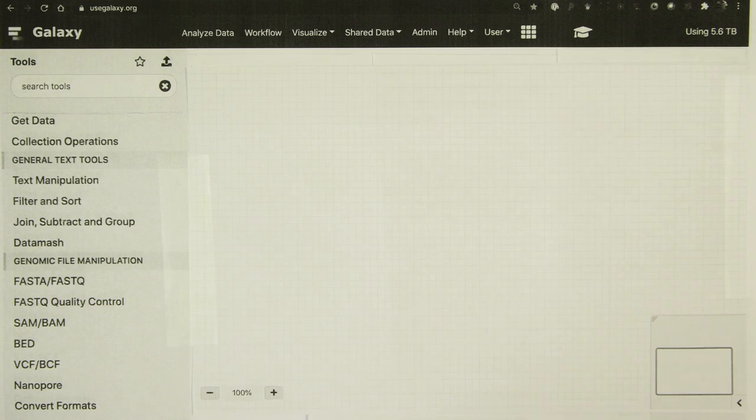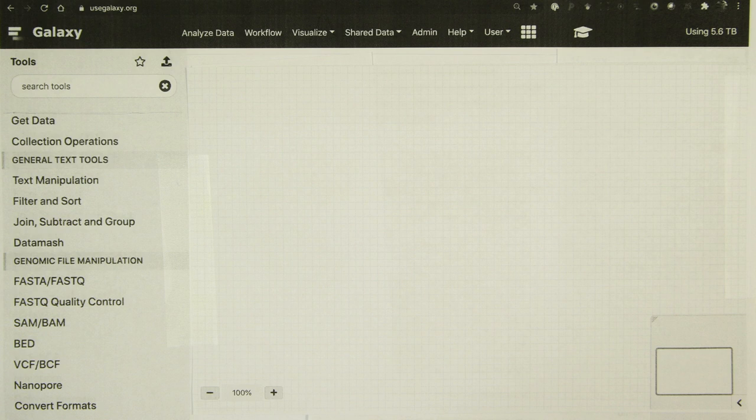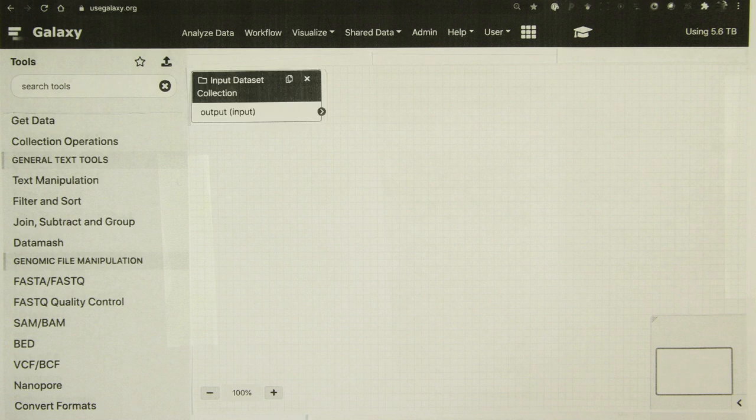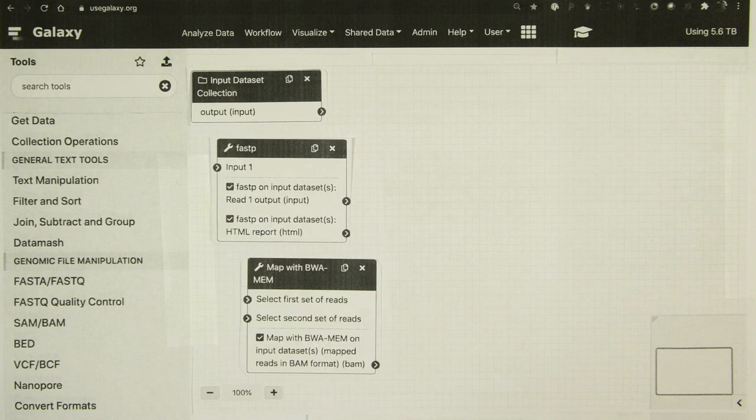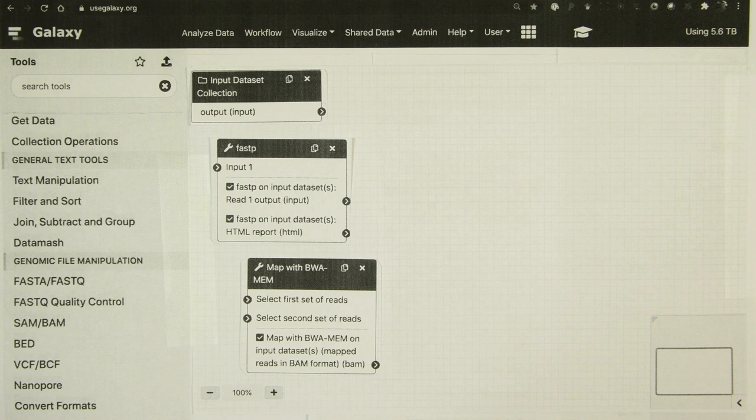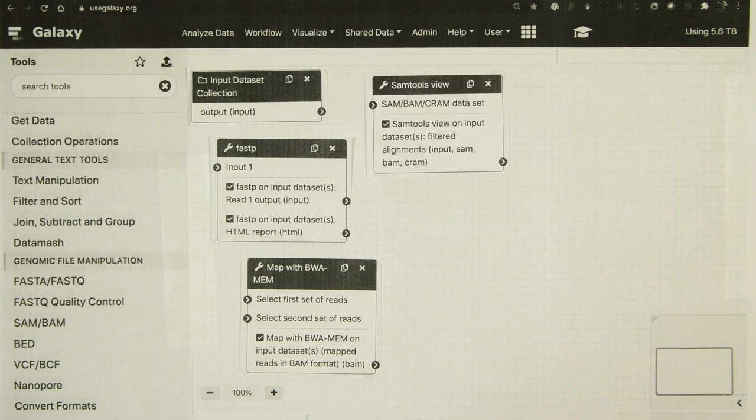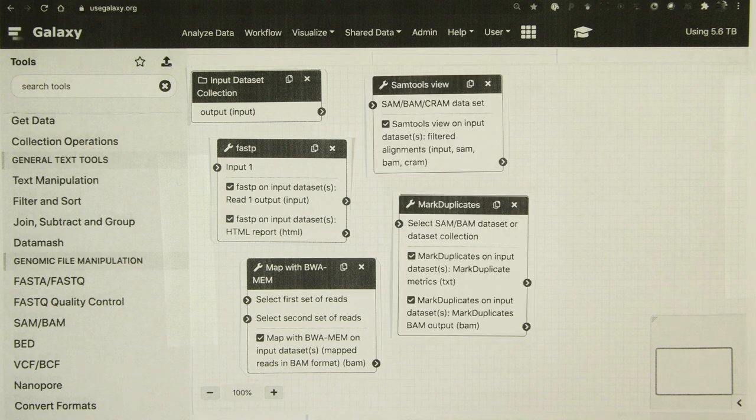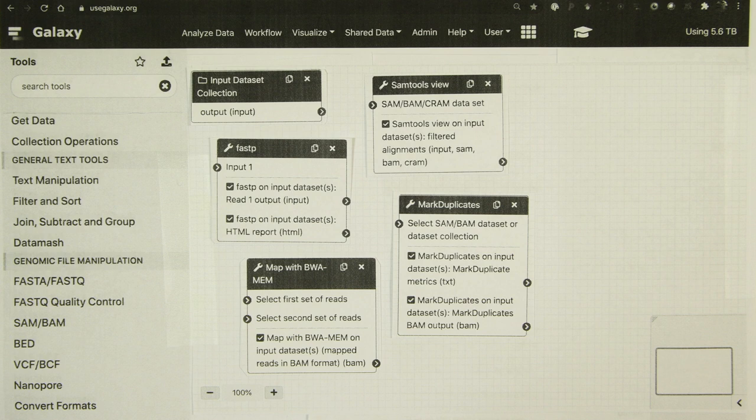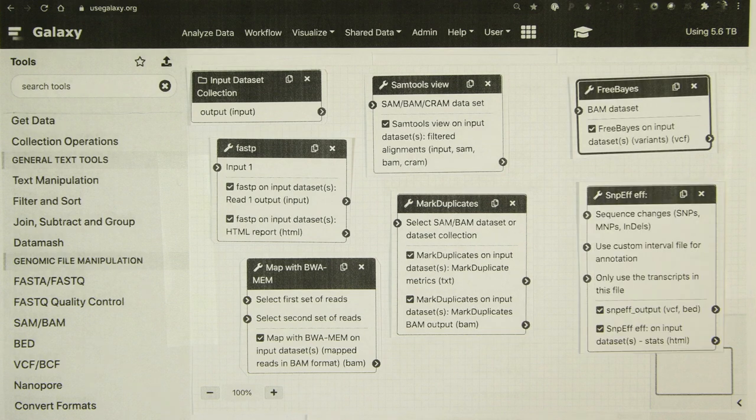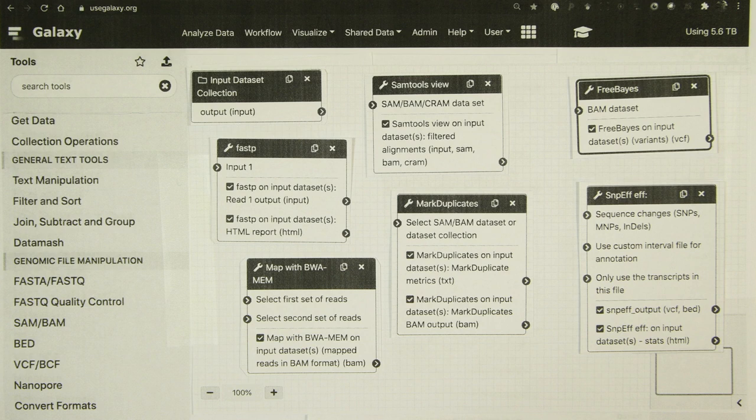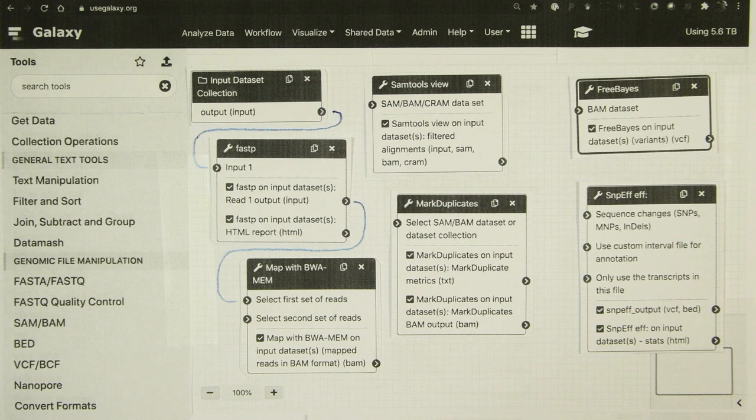So here we have a workflow editor, and let's build a workflow. We'll start with input datasets. We'll add FastP for quality control, BWA-MEM for mapping, SamTools View for filtering alignments, MarkDuplicates for removing duplicates, FreeBayes for calling variants, and SnpEff for annotating them. And we're going to chain them together in a workflow which would look like this.